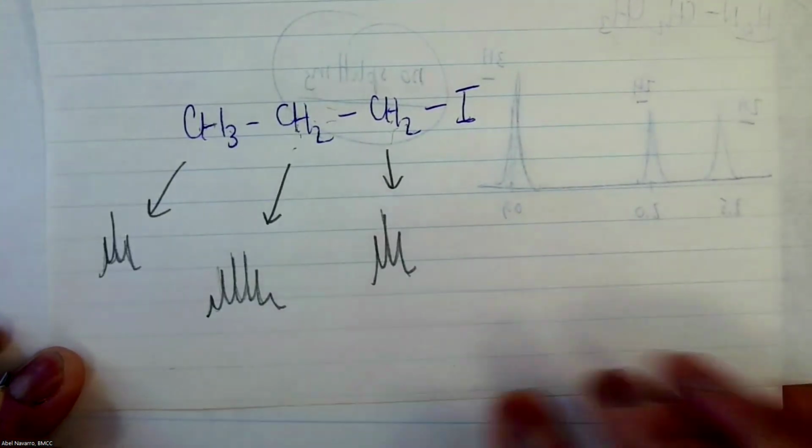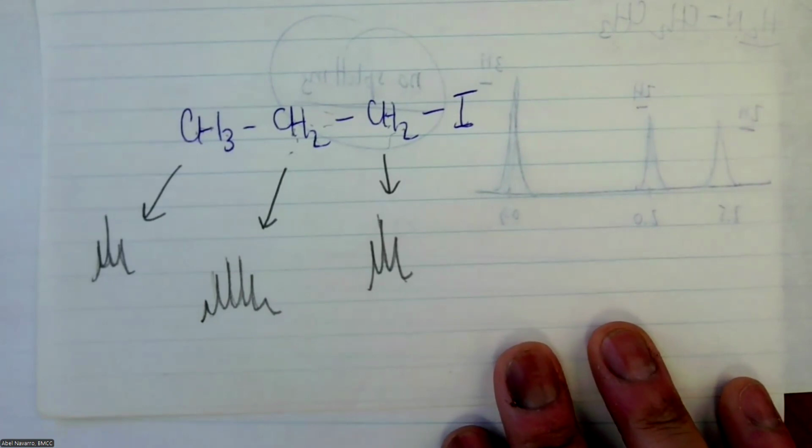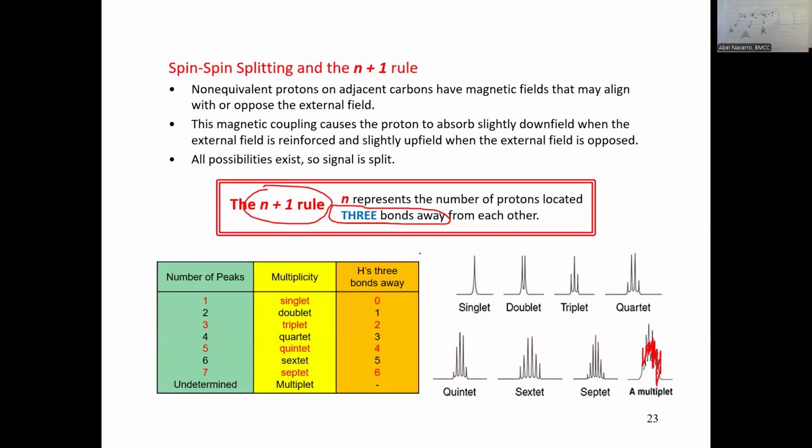Okay, great. It looks good. I really enjoy teaching NMR. I do like it because I see it as a game, really, how to elucidate the structure by reading peaks. Okay, so let's see. That was one example. What is a singlet, right?